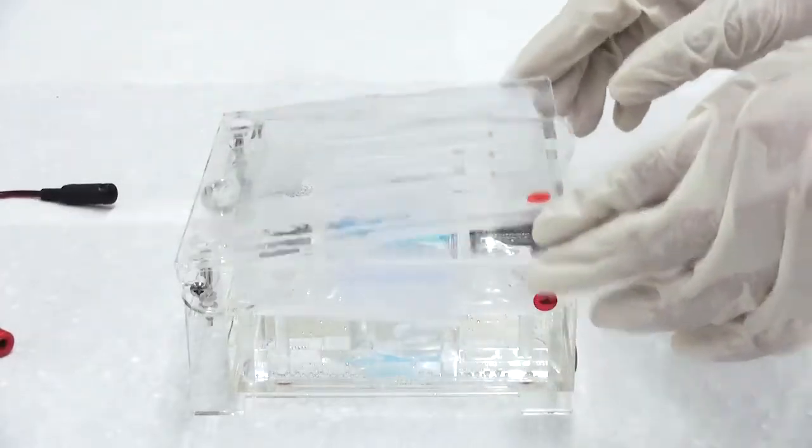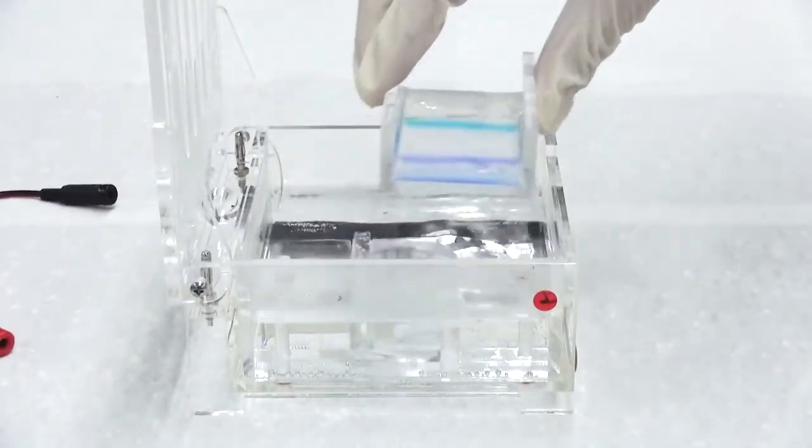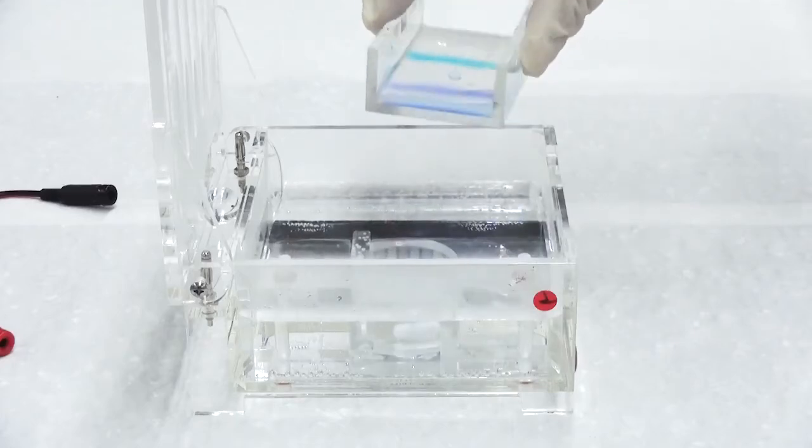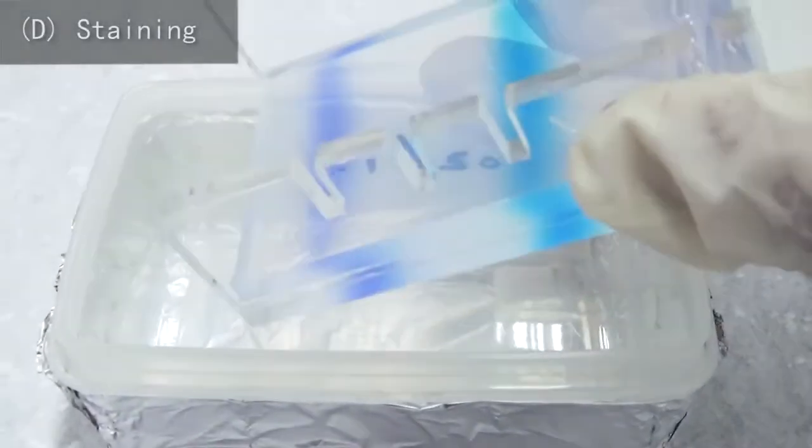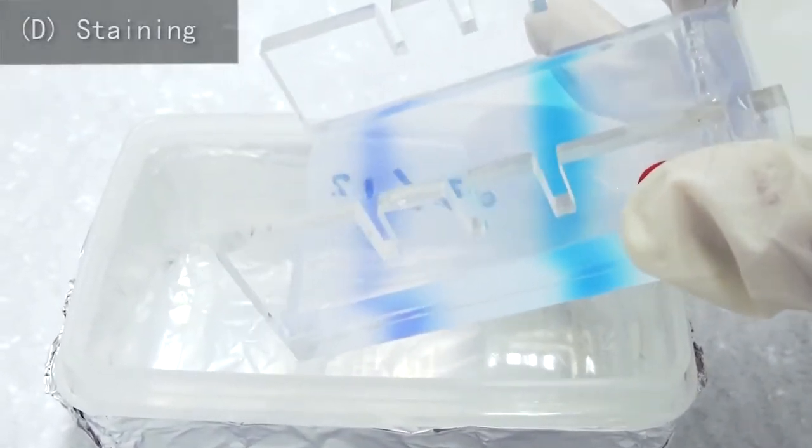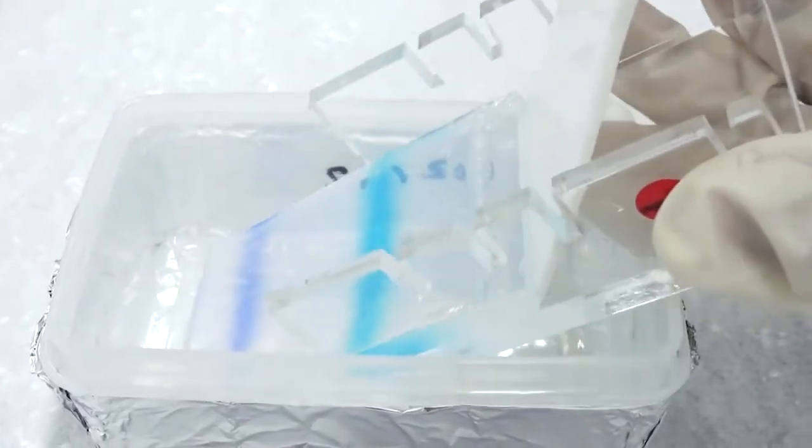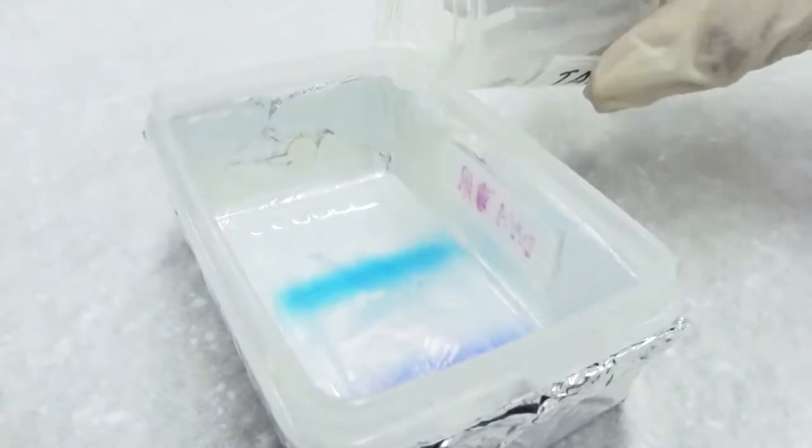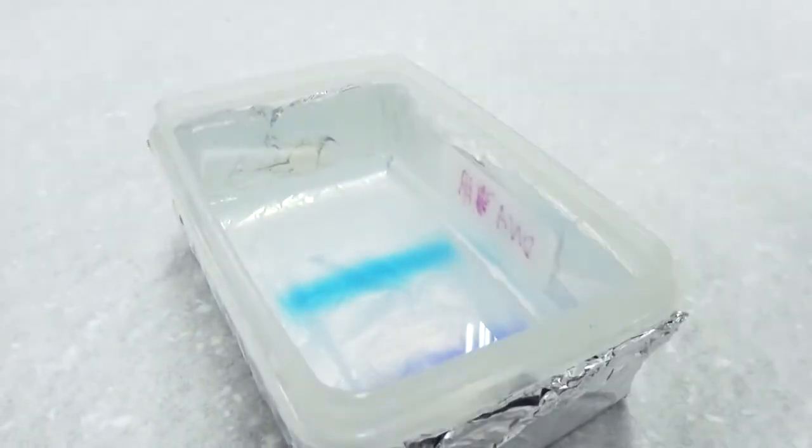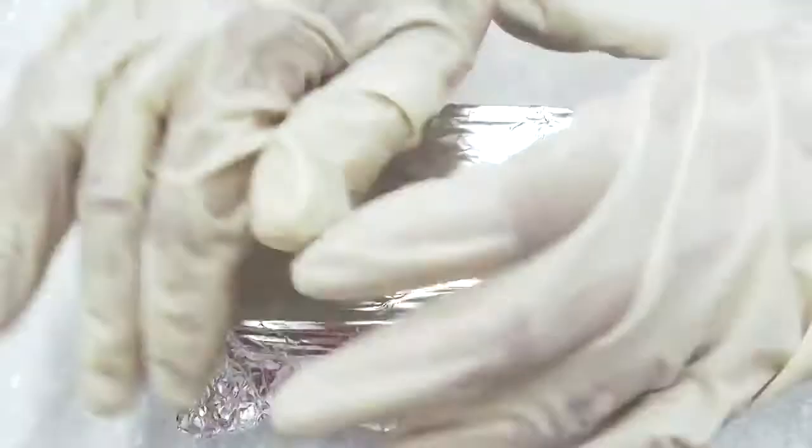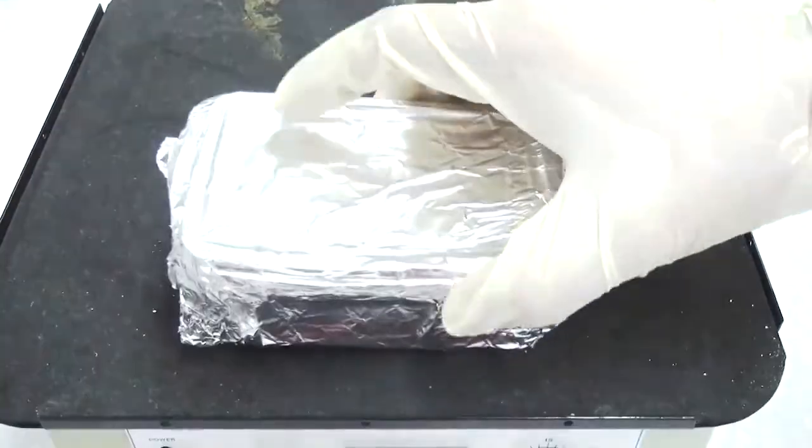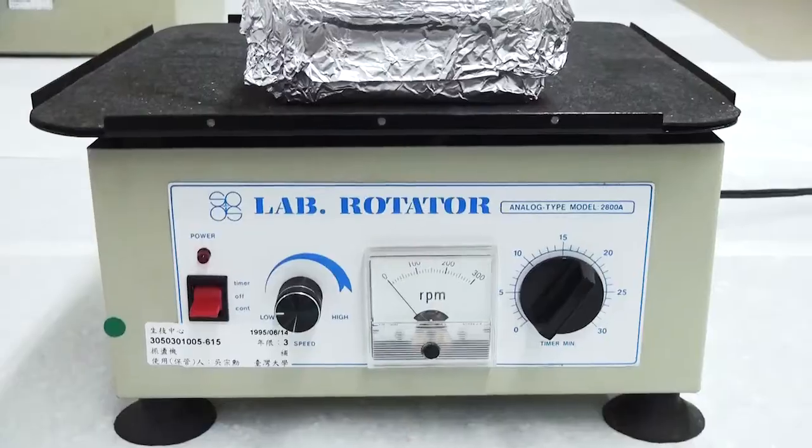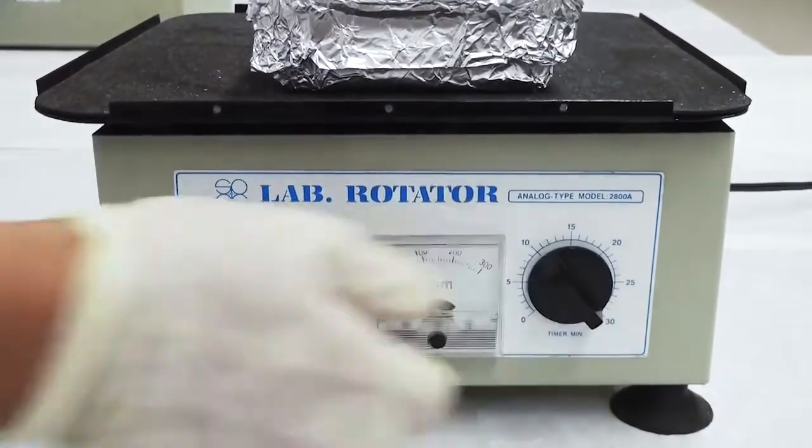Electrophoresis is done. If the loading buffer contains no nucleic acid staining dye, then the gel needs to be stained. Wear gloves to remove the gel carefully from the tray and place it in a staining box wrapped in aluminum foil. Load the required amount of electrode buffer and staining dye. Fasten the lid and cover the box completely in aluminum foil. Place it on a shaker. Shake the gel in the dark for 30 minutes.